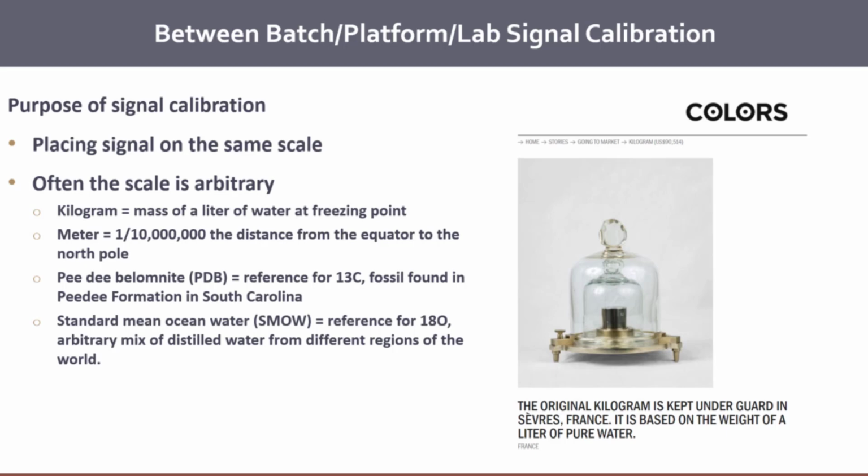People made their measurement, they calibrate their reference material relative to the NIST reference, which is relative to PDB. So you often would make your measurements relative to your reference, which is relative to NIST, which is relative to PDB. But you still always reported your values relative to PDB, even though PDB doesn't exist anymore. So that's kind of an arbitrary value.